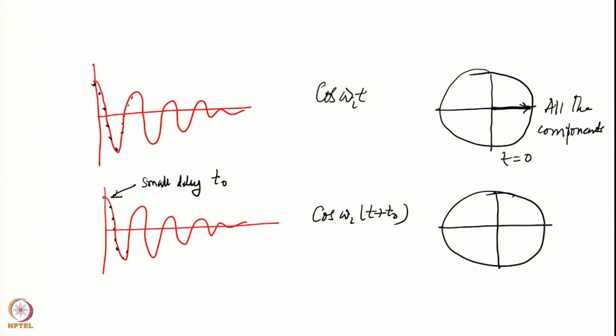I started collecting when the different components have moved to different extents. So let us say one component has moved here, another component here, and the third component here. These are different spins, different lines in your spectrum, corresponding to different spins. So they all have moved to different extents, let us call these 1, 2, 3, and all of these now have different thetas.